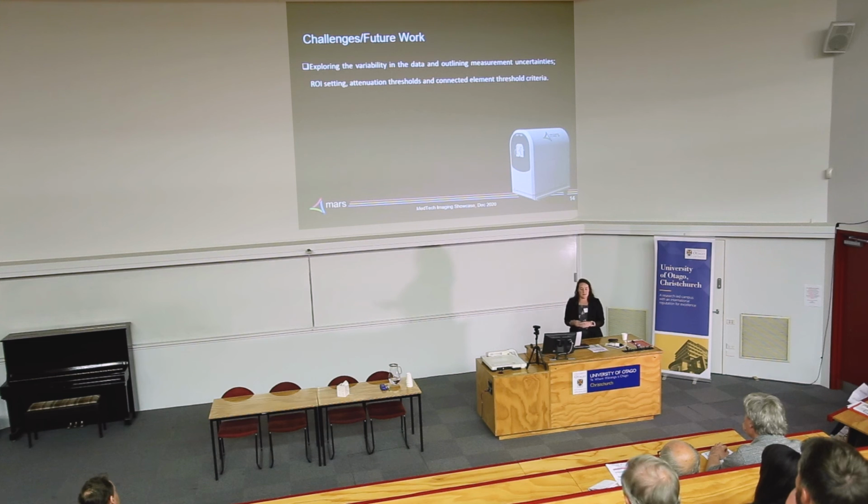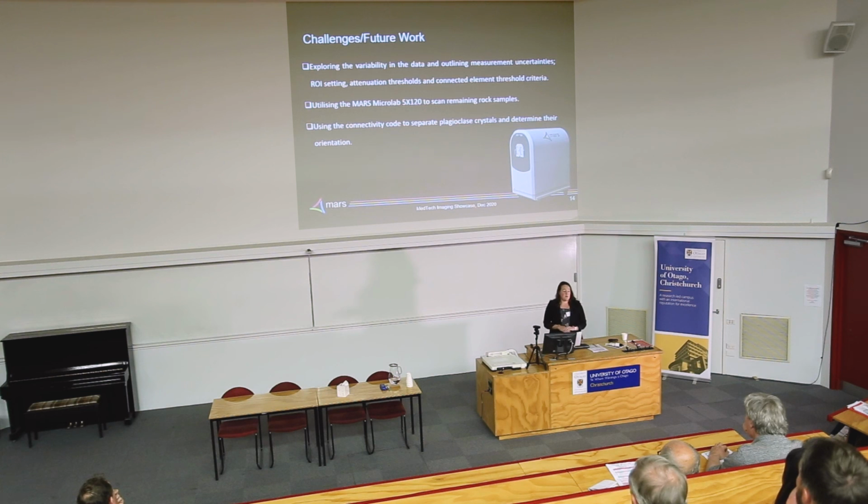because it will just take the average intensity. The next is using the Mars Microlab to scan all the remainder of the rock samples to get a bigger sample size for data. And then utilising this connectivity code to investigate the plagioclase crystals and their orientation. And then automating the connectivity porosity code.